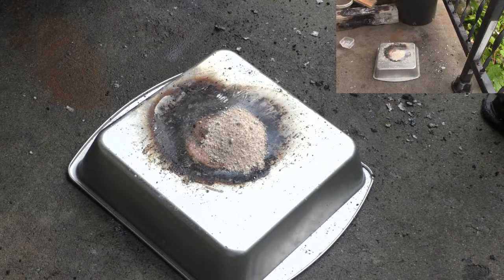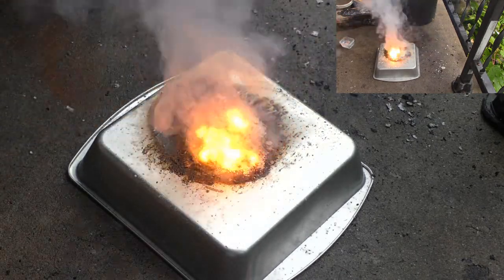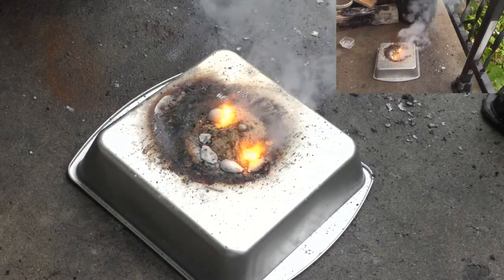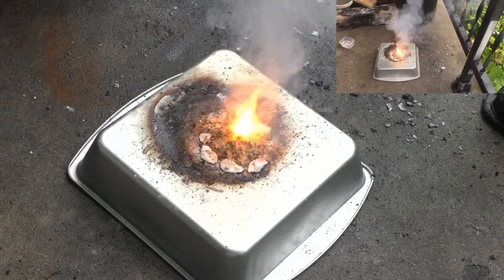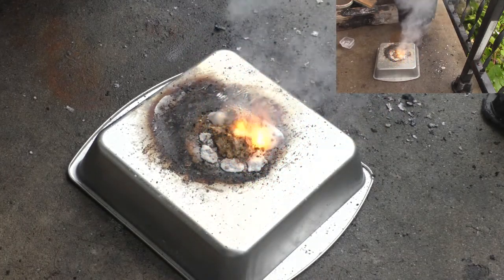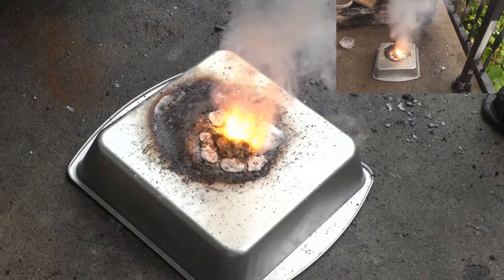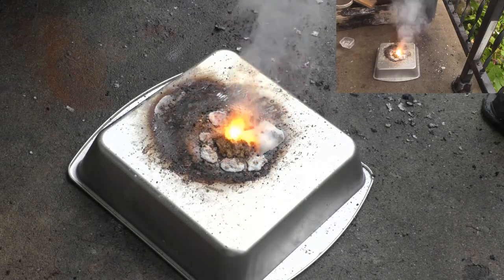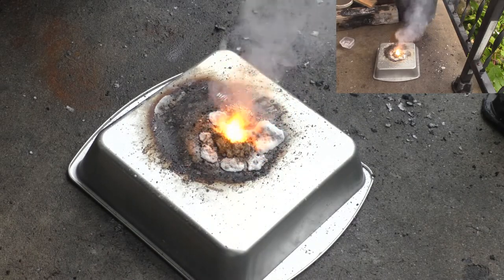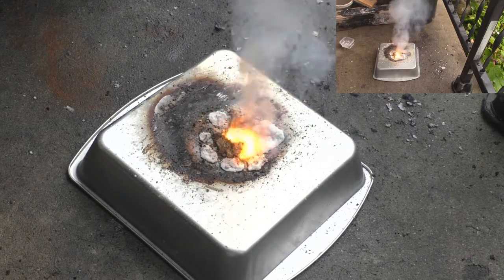Four grams bouillon cube to eight grams potassium chlorate. Three, two, one. That's super reactive! Now these bouillon cubes do have a certain amount of fat and a lot of sodium. Lots and lots of sodium — though sodium chloride itself shouldn't be very reactive. Yeah, just generating a fair bit of smoke.